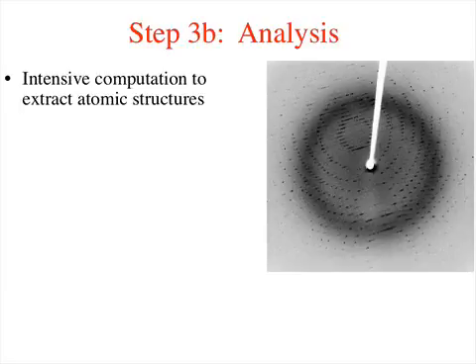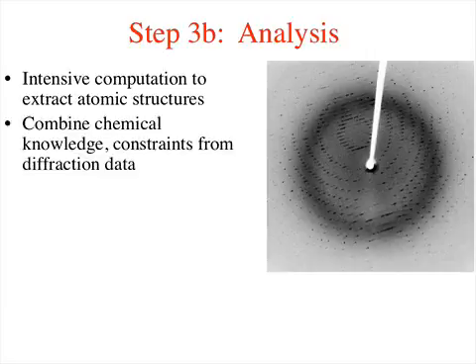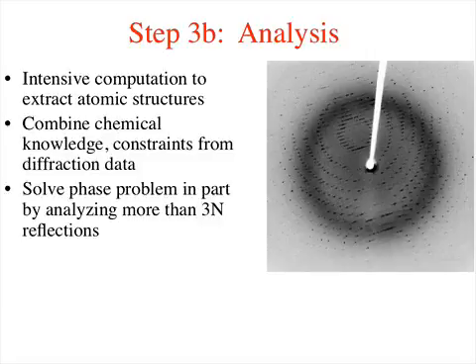And now, to continue from that, you have to use pretty extensive computation. I should say that this is, at this point, pretty much a solved problem, and they have very sophisticated packages that do this work for you. You combine what you know, chemical knowledge about the protein, and various constraints to simplify the job as much as possible.